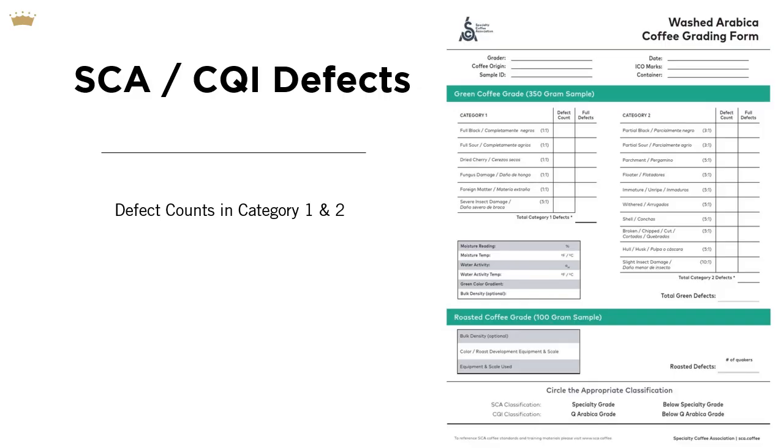Let's take a quick closer look at the SCA-CQI defect count. On the left, near the top, you'll see these category 1s and how, for example, full black, full sour, dried cherry and fungus damage, and foreign matter all equate to a defect count of 1 to 1. That is, a single bean found in the 350 gram sample equates to a full defect, whereas in that same category it takes 5 severely insect damaged beans to equate to a single defect.